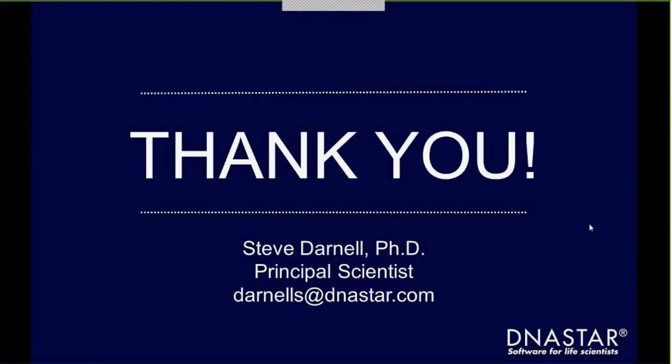If you are concerned about using a cloud system, or you want more control over the entire process and are interested in bringing these tools and workflows into your own computational workflows, we also offer local versions for all three of them. They are currently command line tools, and they run on Linux computing systems. But they are available for those who are interested in expanding their own pipeline or doing analysis in-house.